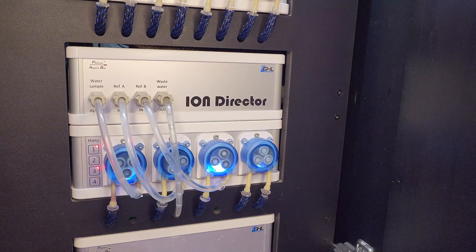Now it was time to reconnect the cables and power it back on. I reconnected the inlet tubes for all three pumps, then connected back the waste and water sample tubes. As for the reference A and B tubes, before I could connect those I had to prime the tubes — all it took was a quick press and hold of the buttons for pumps 2 and 3.